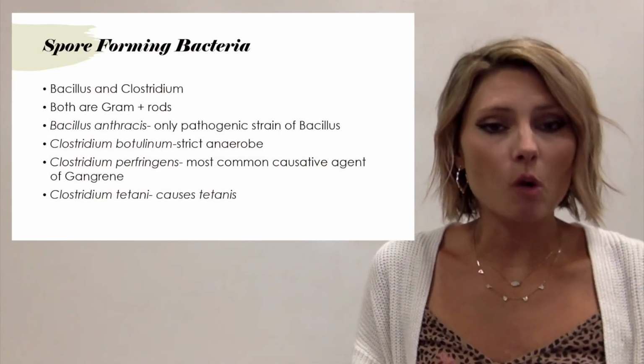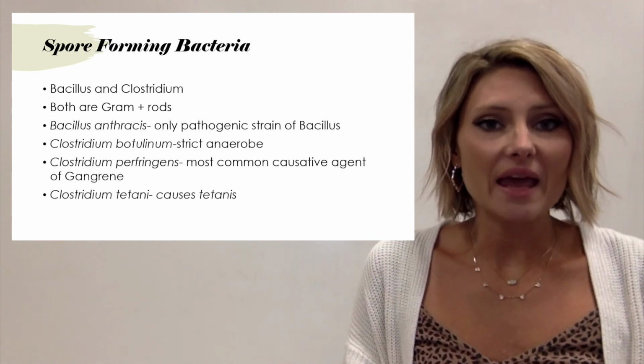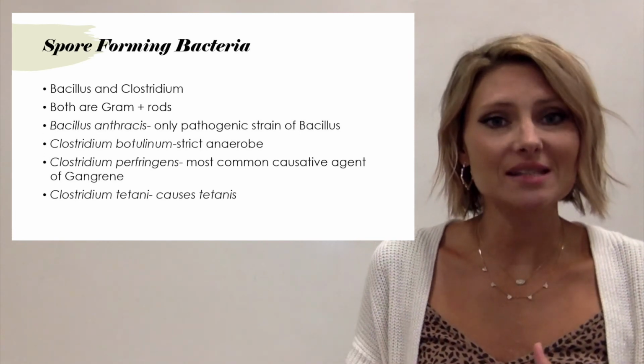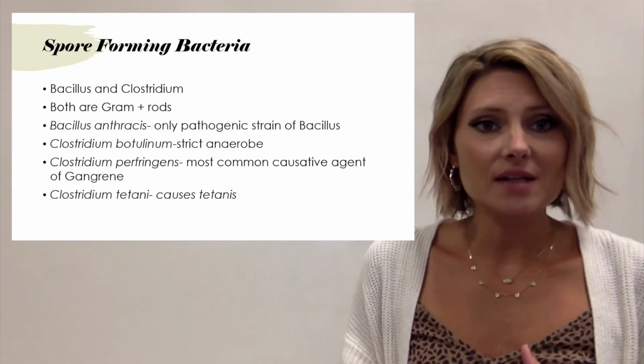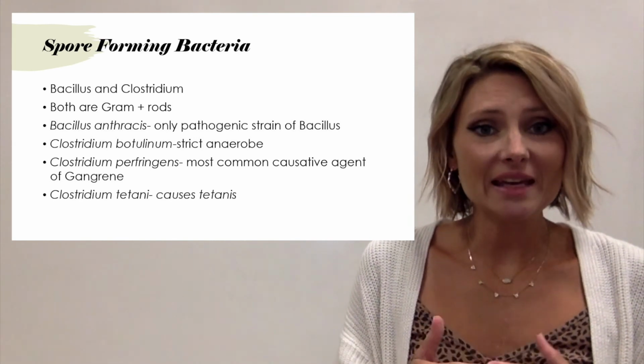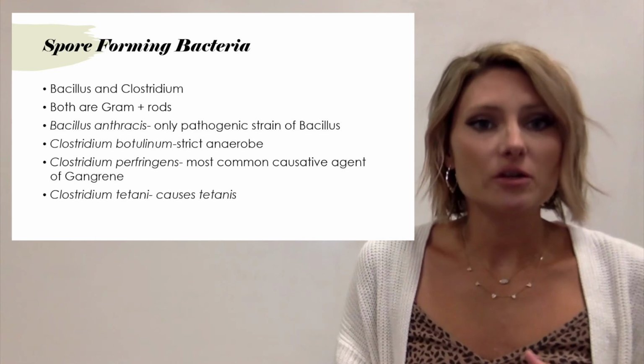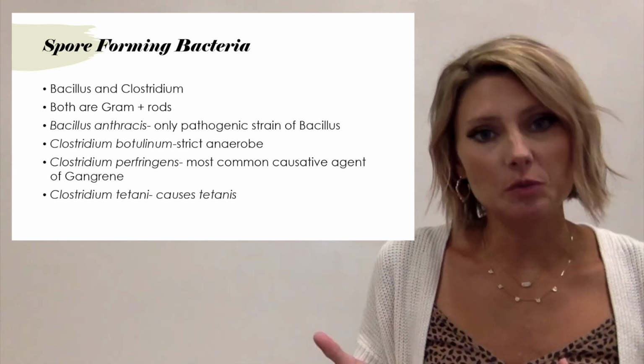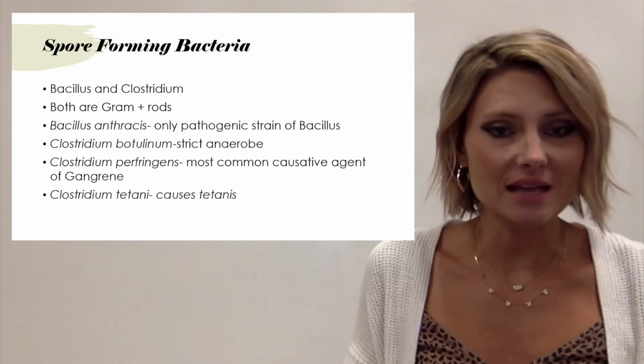So spore formers are bacteria that form spores. We have to have a special technique to be able to stain the spores because they are so heat and chemical resistant. You can't stain them using the normal gram stain or a simple stain. So we have to have a special stain to stain them.